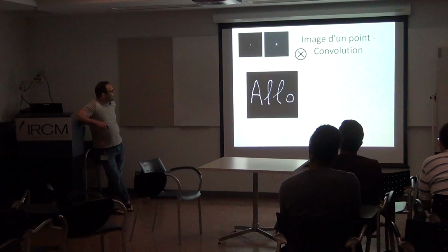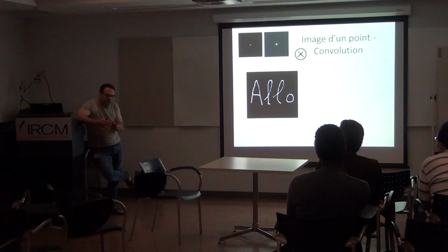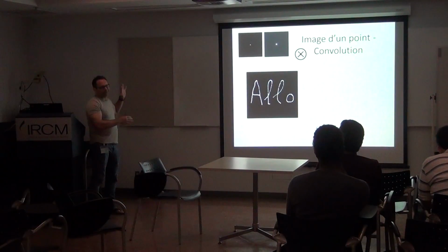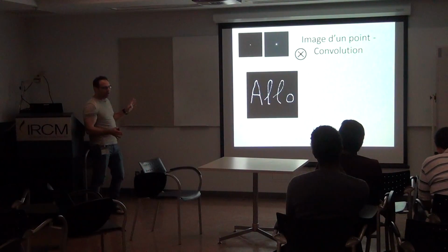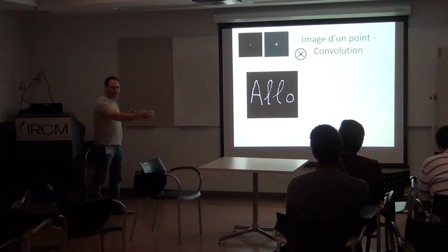And this is basically the technique. Maybe you've heard about deconvolution. And maybe in maths, you've heard about convolution. Maybe not. So it's a nice term, and it's just a mathematical thing. So a convolution is a product of convolution. Usually it's two operations. So it's a multiplication of two terms inside an integral. So basically that's a convolution. So it's a product of something into a summation of things.